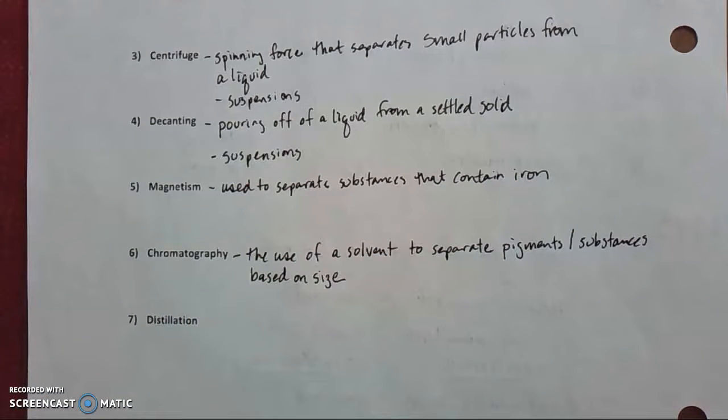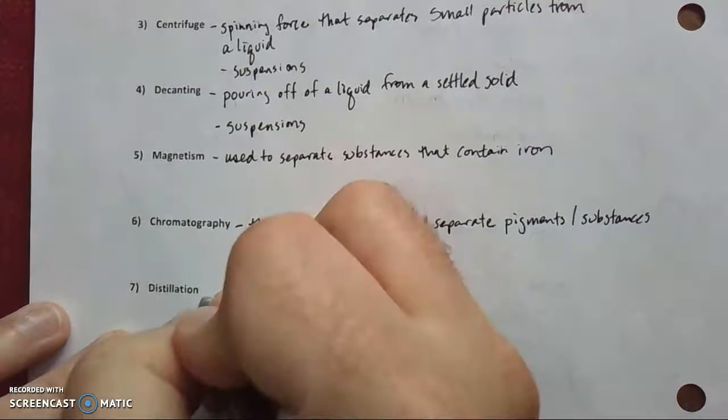So you might have done this in biology class where you separate out the pigments that make up chlorophyll, the green pigment in plants. There's actually 4 different pigments in there, and they travel up through a piece of paper. The big pieces can't travel as far as the small pieces, so one pigment goes higher than the other. We can demonstrate this with different colors of marker to see what different colors are made of. So like a black Sharpie is going to have red, yellow, and blue pigments in it mixed together to give us black.